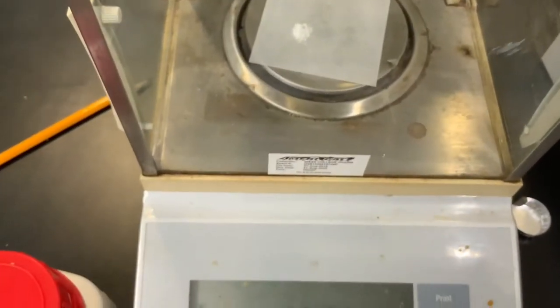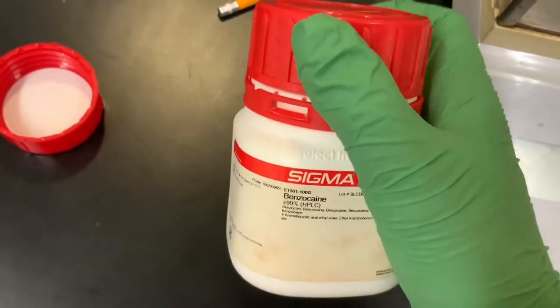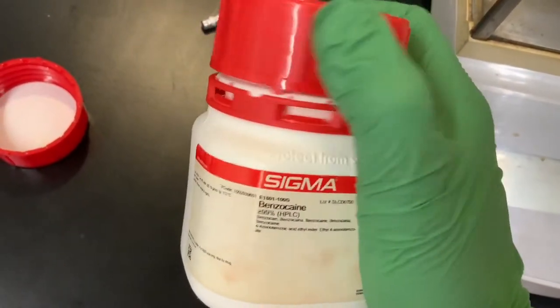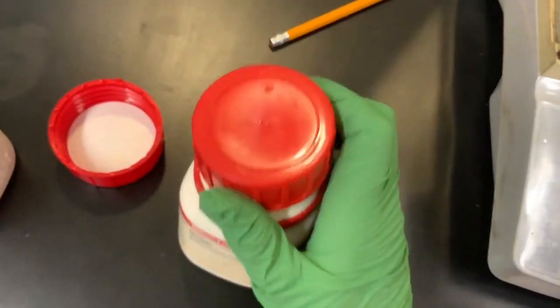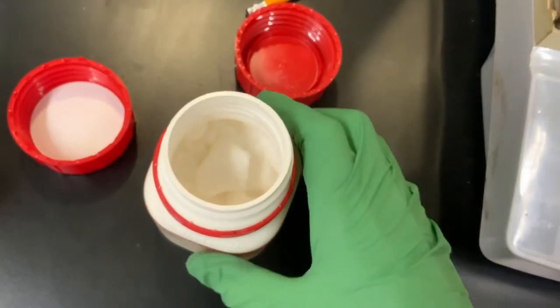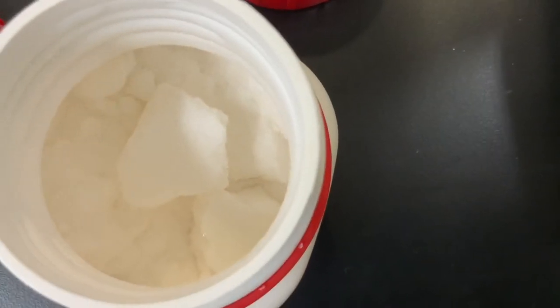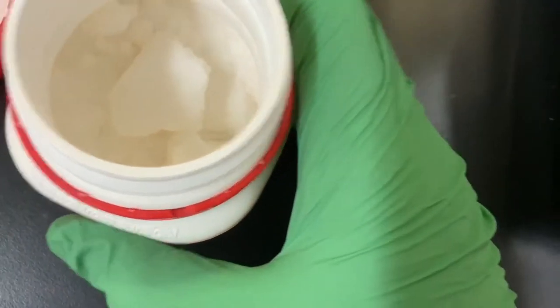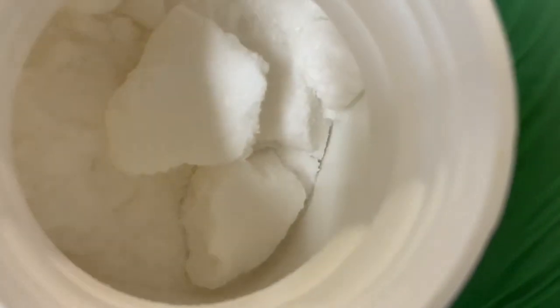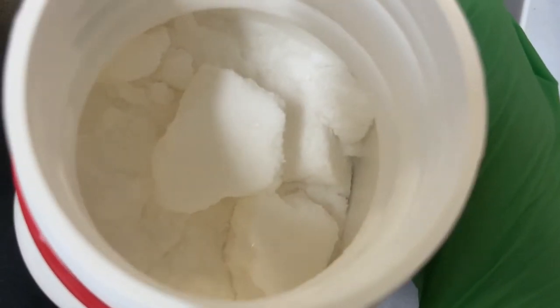And then lastly, benzocaine, which is a white solid, 52 milligrams. And so this is benzocaine. And if we look just to see what this solid looks like, we can see that this is sold as like a large clump, but it can be broken apart, and you see here that it's also nice, white, shiny, crystalline, organic solid, right?